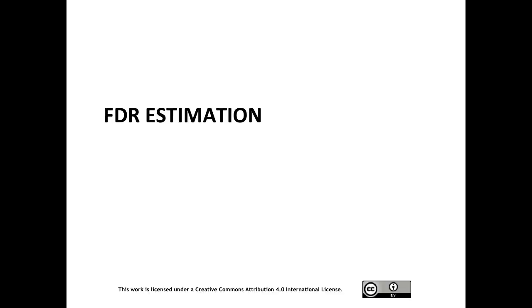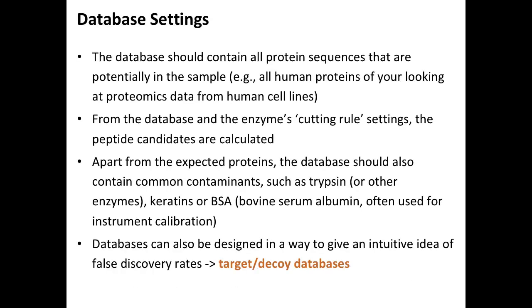What we are doing is really trying to understand how reliable the identification is, and we're now talking about the PSM, the peptide spectrum match, and I will get back to that later on. It's essential to know what FDR we're really talking about, because there are different FDRs. FDR is a very general concept, and it's meaningless if you don't specify what you're trying to estimate.